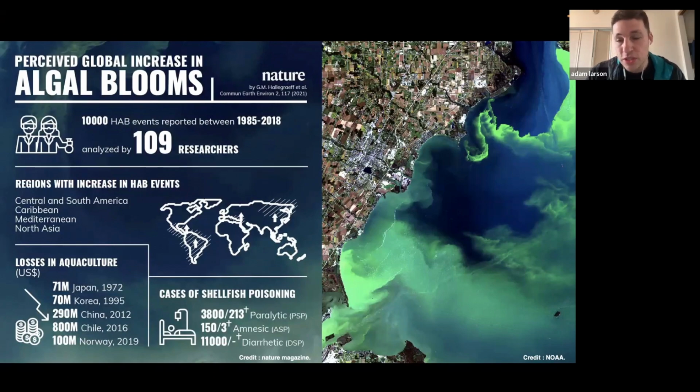If you consume shellfish that have accumulated this one dinoflagellate, you can get paralytic shellfish poisoning, which is really devastating health-wise. The symptoms can be hard to diagnose initially, and the actual toxin is almost undetectable unless you have very advanced imaging to look at the actual molecule. But one thing that is very easy to see is the actual algae. So using microscopy, we can detect when it's becoming highly abundant, and make this a sentinel or an early warning device for the algae bloom.